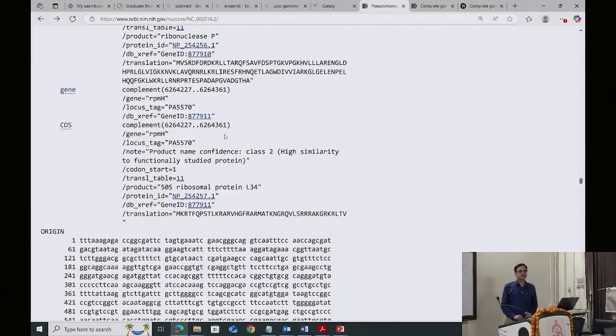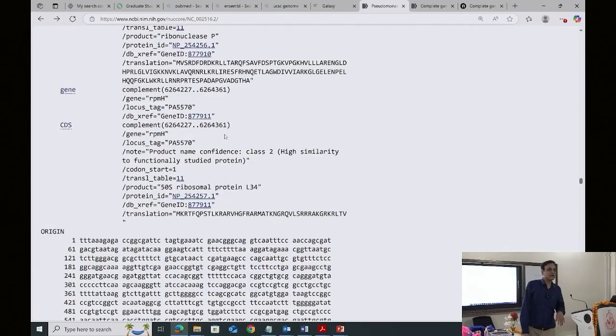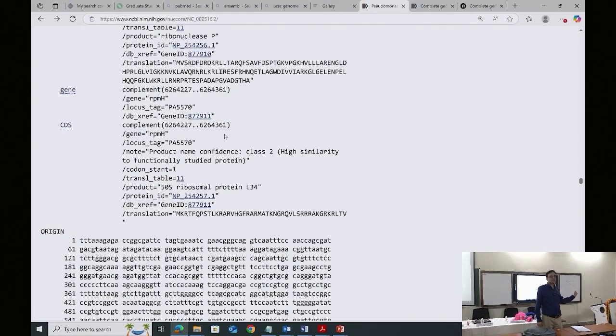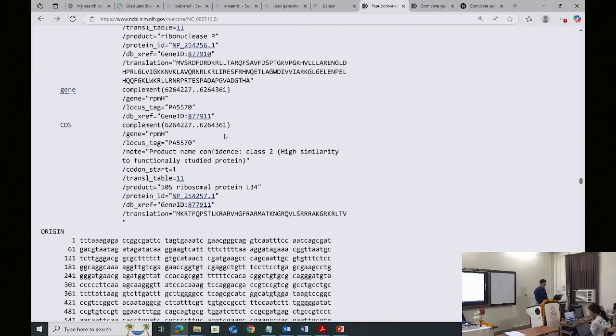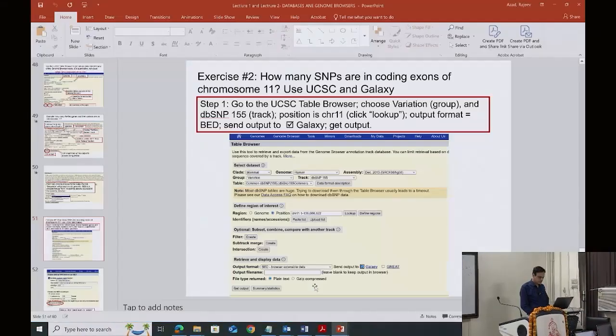So the last 15 nucleotides come after the last feature, the last gene. So they are not part of a protein coding gene, because that is the last gene. Clear? Okay. So now use the genetic code table, and I think I have provided you the lecture 1 genetic code table.